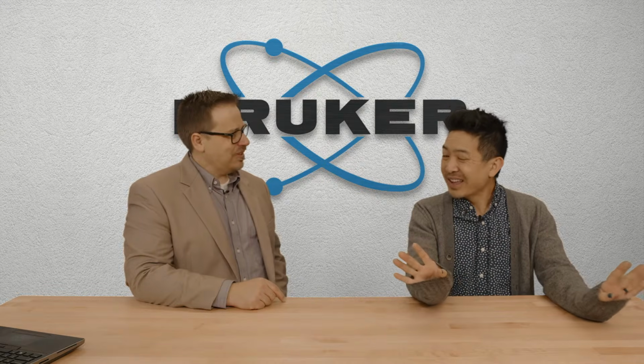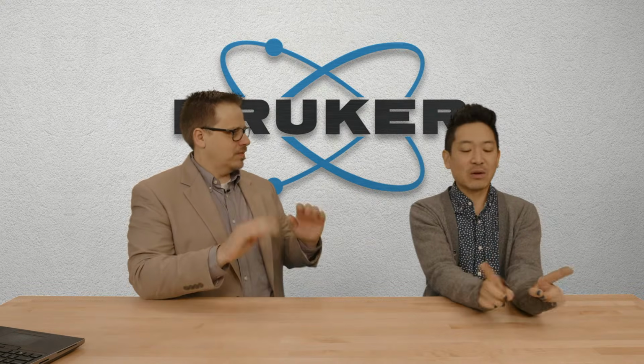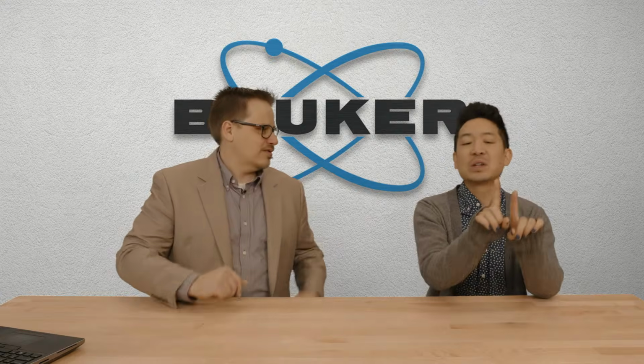Yeah, so what we see is, of course, like any data that we're going to be looking at, we've got an x-axis and a y-axis. The y-axis is going to be intensity, so those are the number of x-rays that are hitting your detector. That's easy enough. Along the x-axis, though, generally speaking, you're going to see something called 2 theta. If you check out our YouTube list for what is XRD, you've got a tube and a detector, and they're both moving at an angle, generally, and so you've got theta and theta. 2 thetas. So 2 theta is what you see along the bottom axis.